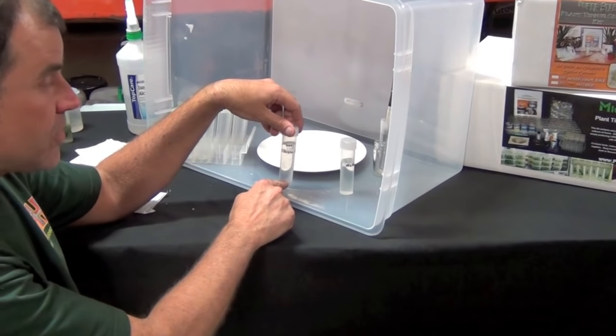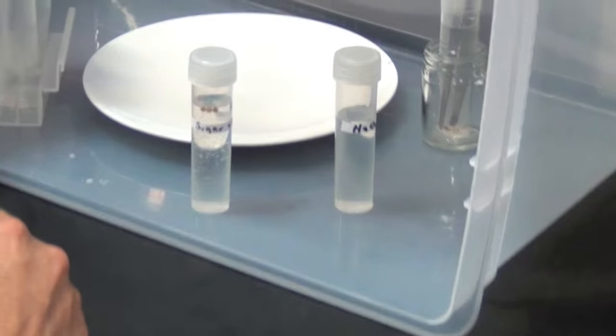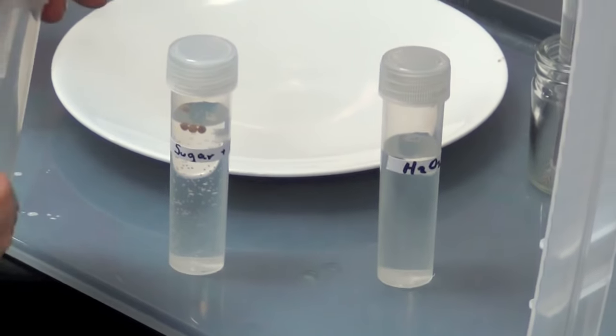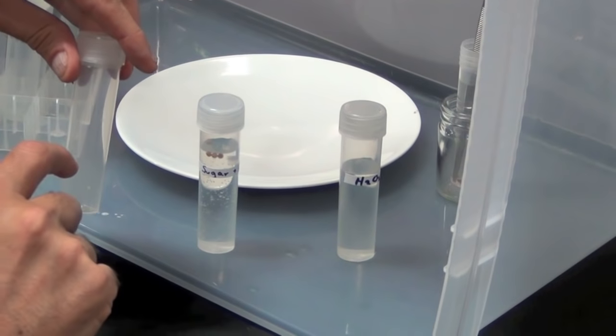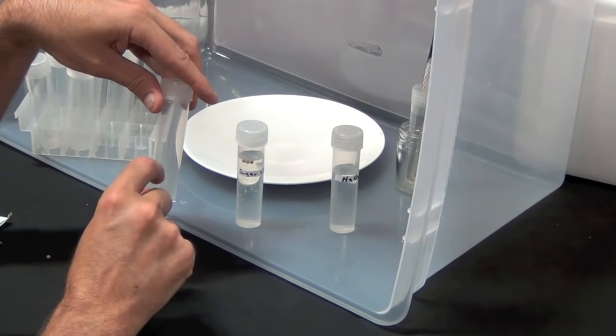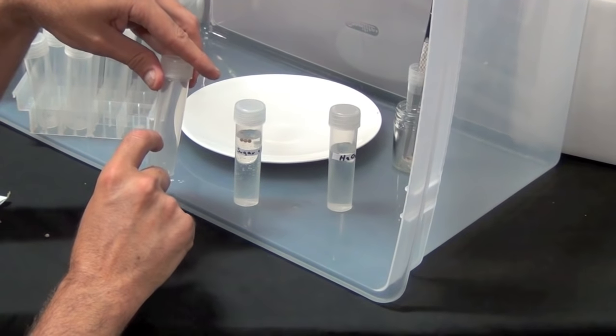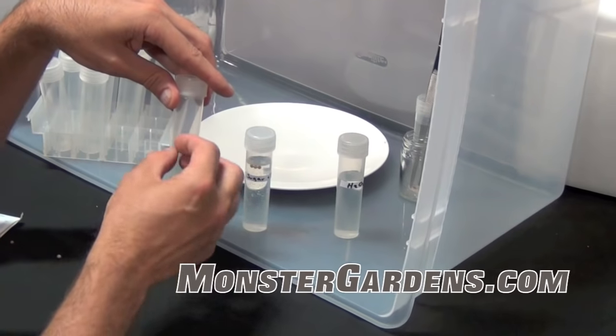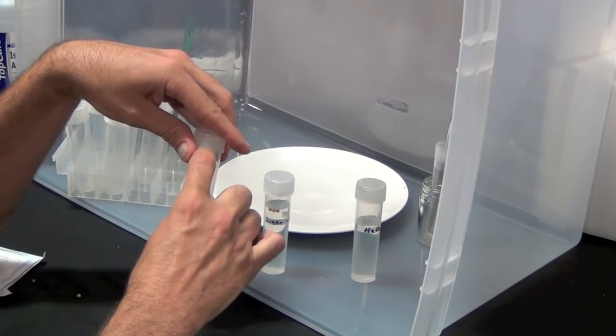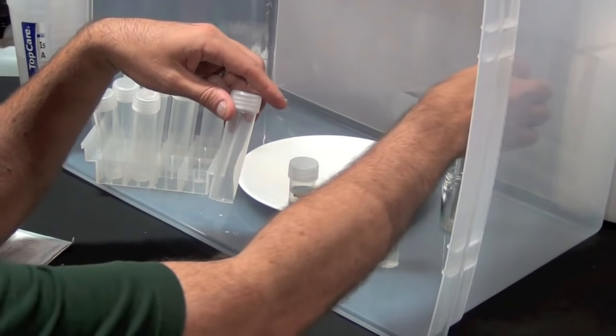This sugar and oxygen solution will soak into the seed and the seeds will sink. When the seeds have sunk, we'll take those out and move them into these tubes. I've made medium for sterile tubes that contain sterile coco coir with a little bit of sugar and nutrient solution in it. That will give the seed a perfect medium to germinate in - it'll start growing roots in here and gives the top of the seedling room to grow.